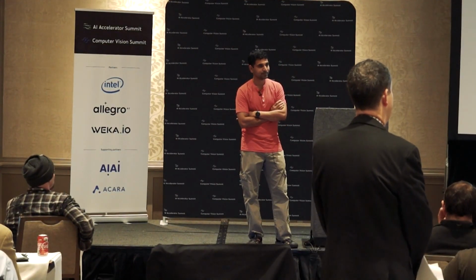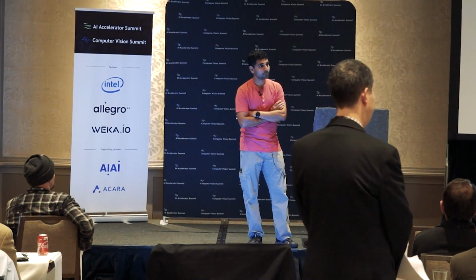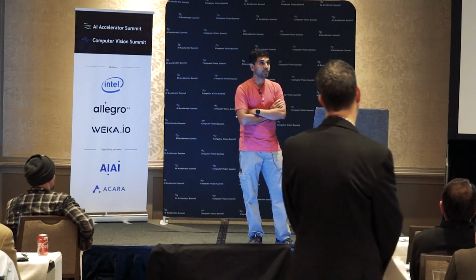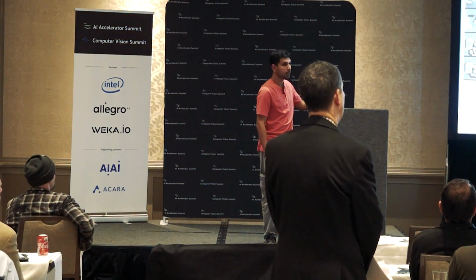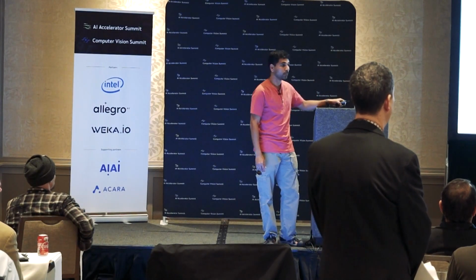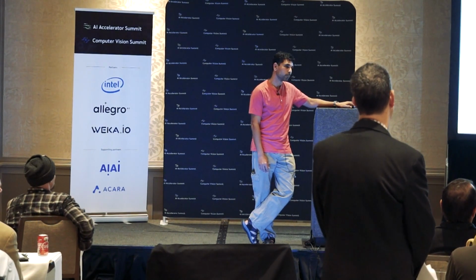Now, I just want to know, when the scientists are actually looking at the images in the postdoc study, all these images are coming out from a microscope, and I gather that would be streaming data. So these are mostly, are you talking about the last slide? Yes, the slide before the last slide, I'm sorry, I couldn't see the number. The one before this, yeah, this one. Okay. So when you're actually having a pipeline coming in, are you doing all the processing on the cloud, or do you have any kind of models deployed on your optical phenotyping microscope?